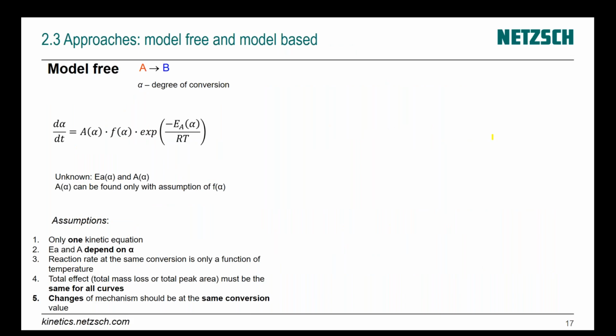It is very simple, very easy. It was created in the last century, and here only reactant and product exist. No information about intermediate steps or intermediate products is taken into account. And for this general approach, only one chemical equation exists. Only one Arrhenius equation exists. And that's all. But you know, in reality, it's not so easy.